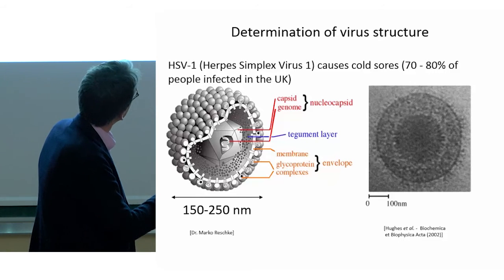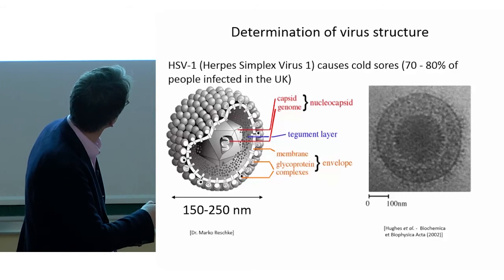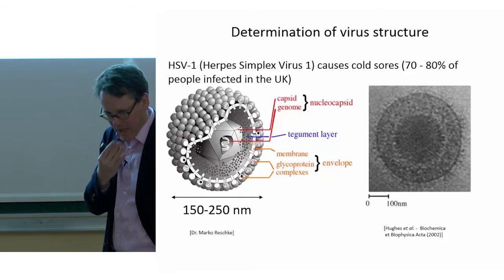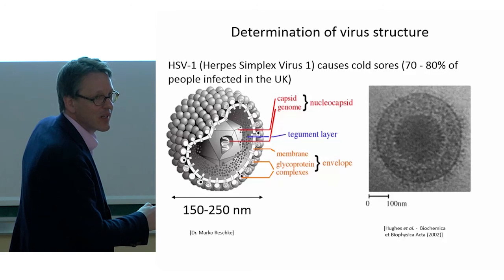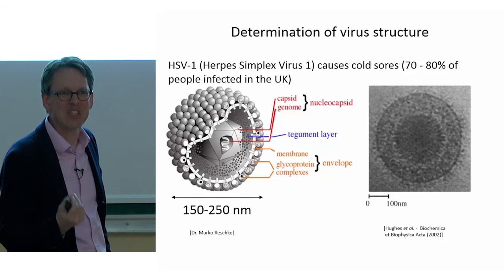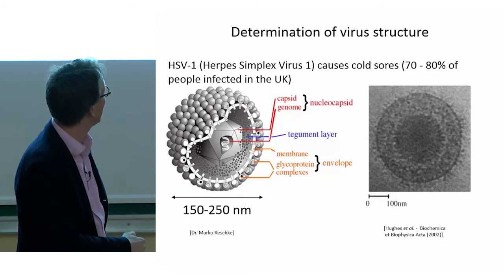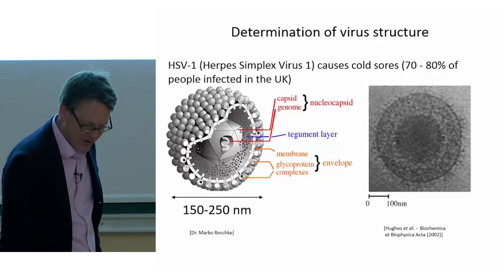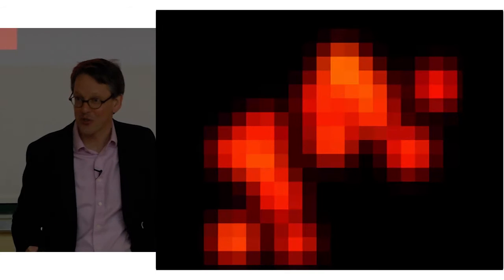And so if you take an electron microscopy image of this virus particle, here's what you see, right? So you get nice ultrastructure. You see the shape, you see the capsid in the middle. But what is hard to do with electron microscopy is to be specific, to say which protein is where in here, right? That is a hard thing to do with electron microscopy, because labeling specifically is a hard thing to do, and getting all the proteins, but that's not a problem for optical techniques, right? So high resolution, but low specificity and sensitivity for electron microscopy. Light microscopy now has this problem. It is high specificity and sensitivity, but low resolution, right?